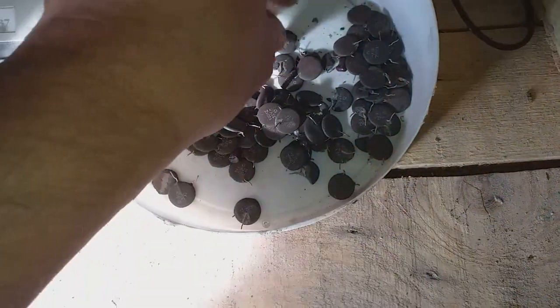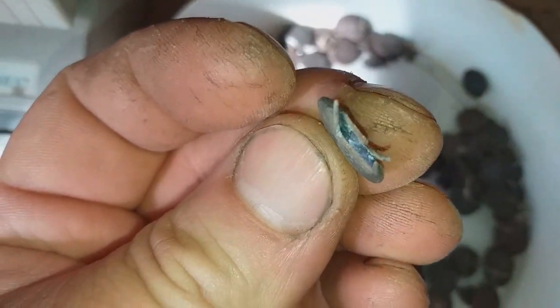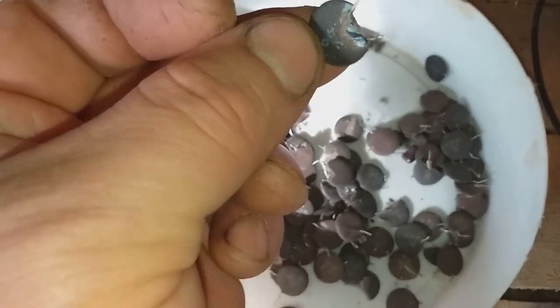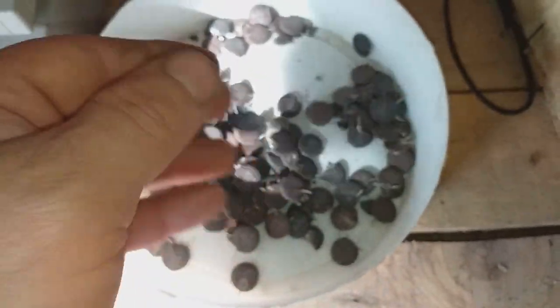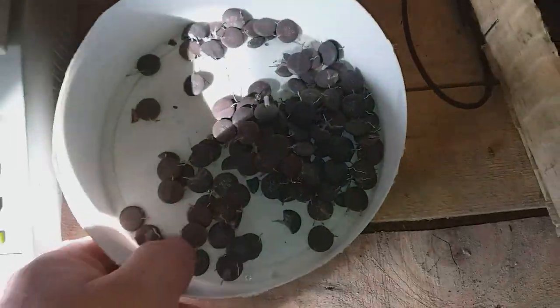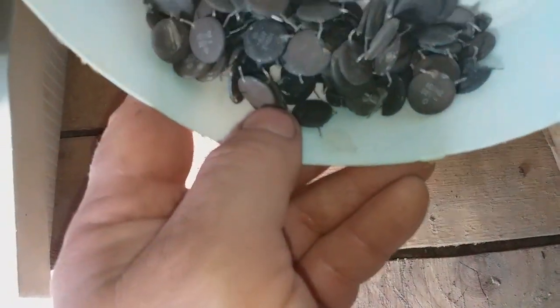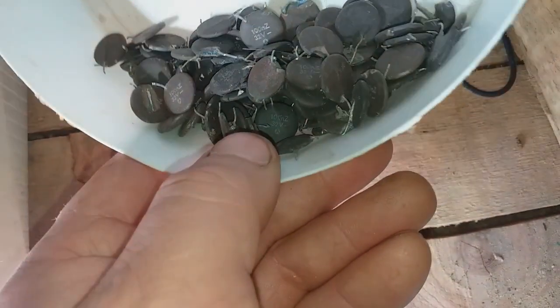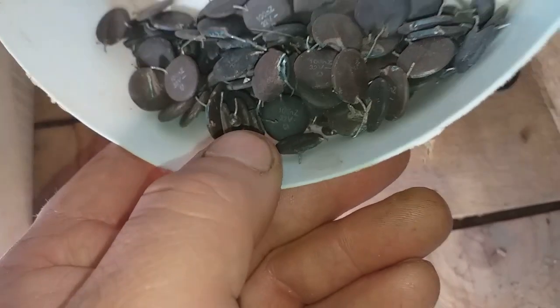I got a decent amount and when I cracked one open inside I got a very decent base, so maybe this stuff contains not only silver but palladium too. I will put that on the scale and see how much we got, then process it like always: burn, crush, and process in nitric acid.